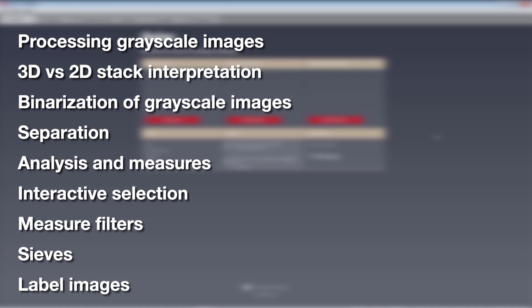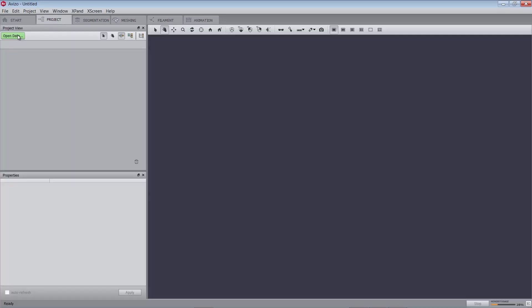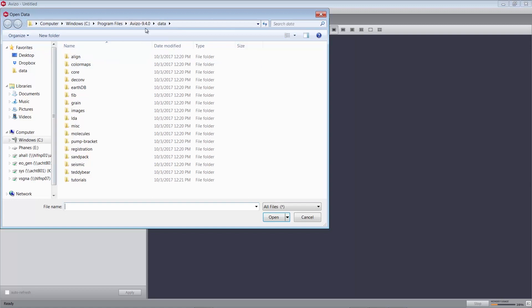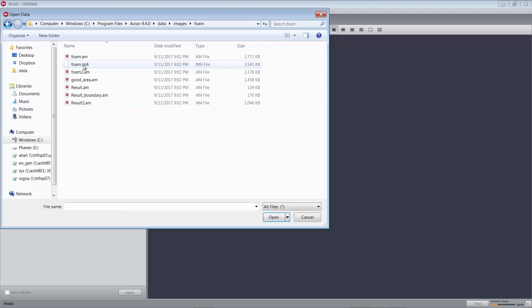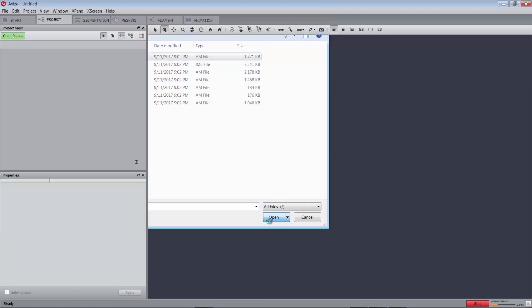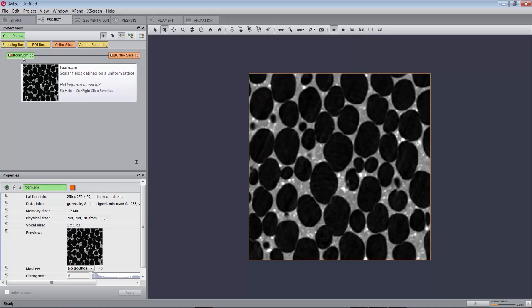You should be familiar with the basic concepts of Amira or Aviso to follow this tutorial. In particular, you should be able to load files, interact with the 3D viewer, and connect modules to data modules. We'll begin by processing images. First of all, you have to load a 3D microtomography volume into Amira or Aviso by opening the project workroom, clicking open data, and from the Aviso root directory in data, images, foam, and then foam.am. This object will appear as a green rectangle in the project view.